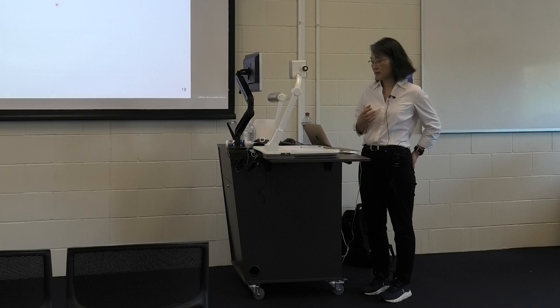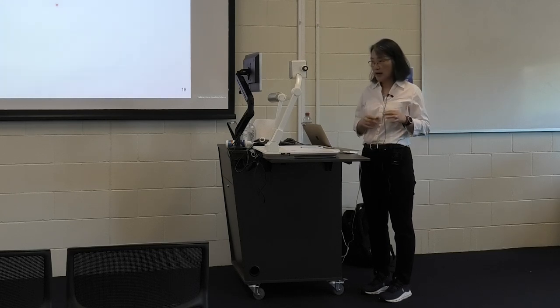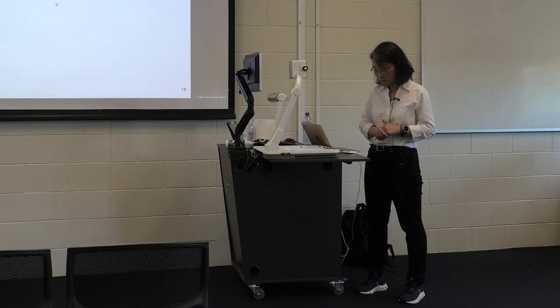Okay, I'm going to continue and talk about the second part of the homonuclear fluorine-fluorine spin exchange experiment, and then I'll move on to the heteronuclear situation of how to measure distances. So I talked about the isotropic shift difference exchange. Traditionally, what you think about in correlation experiments is measuring cross-peaks.